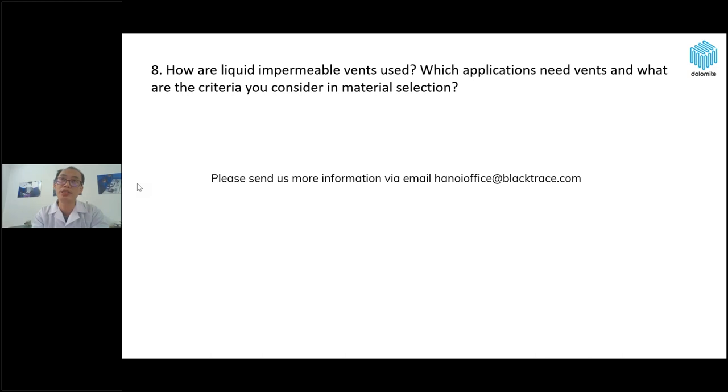With the automated nanoparticle system, we have a modular system. We have modularized pumps, and we can add more pumps into the system. So in this way, I think we could do it with the automated nanoparticle system, by just adding more modules like pumps and chips in the system and doing it step by step. I hope this helped with this question.